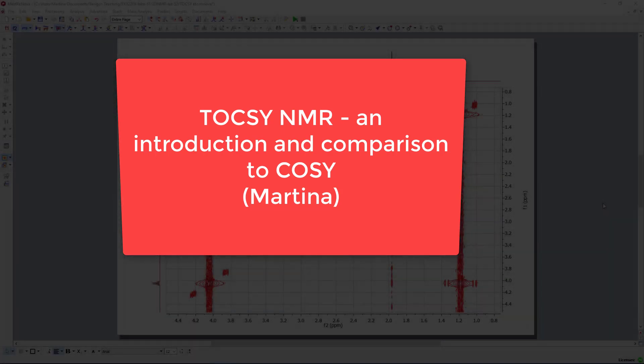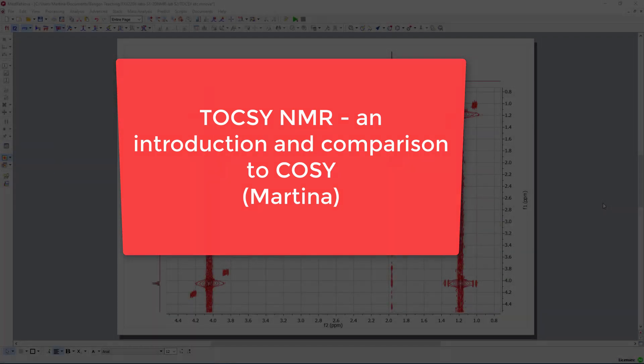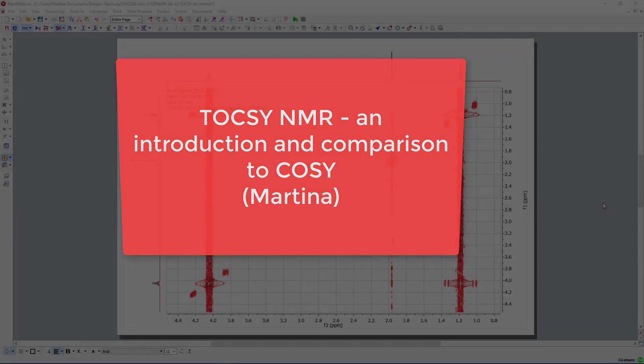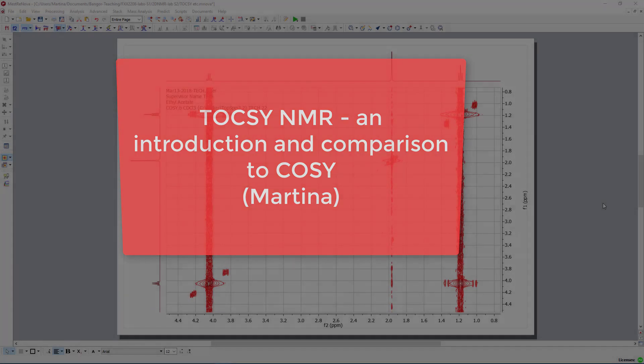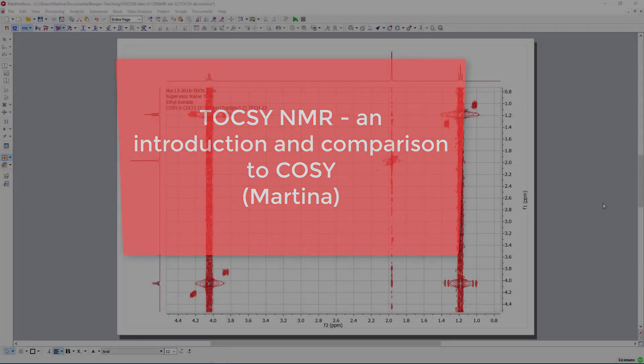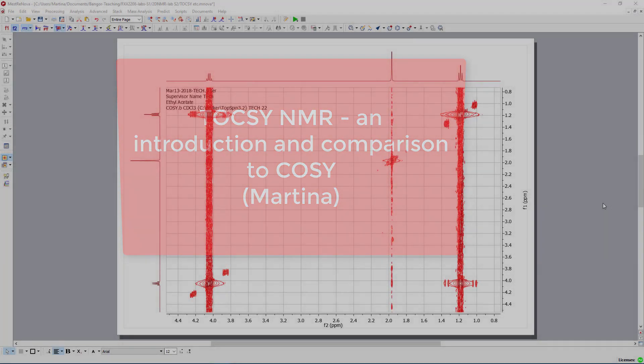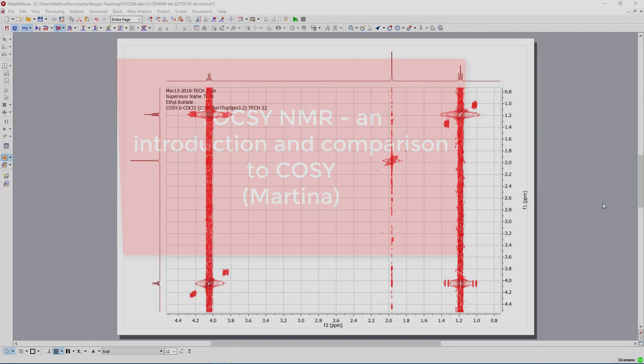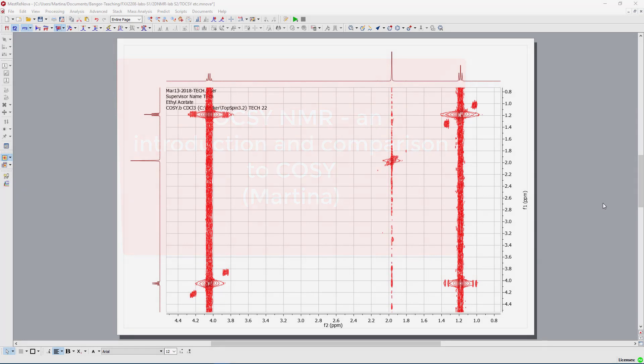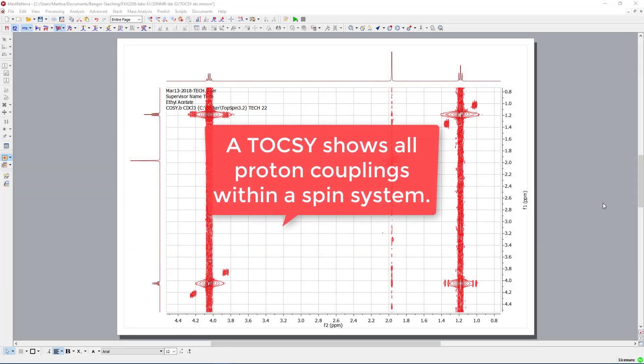It's somehow linked to a COSY, however it goes through a whole spin system. What do I mean with this one? You see correlations as long as you would see couplings between hydrogen atoms, between protons.